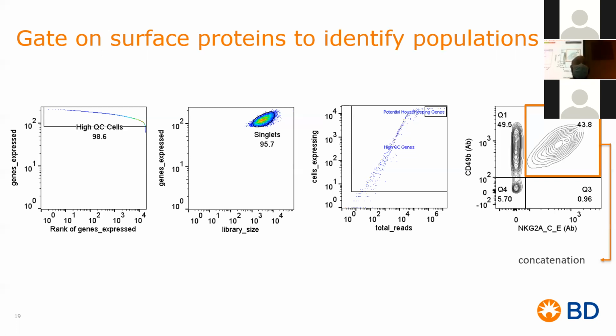Because most likely all my untreated had low expression of cells, and I removed those. I can't compare something non-existent to something that is existent in the analyses. So the QC step matters on what kind of question you're asking. So this is a targeted panel comparing untreated versus two different types of treatments, so I don't include dispersion. If I was doing something else, where I just wanted to see the difference of genes within one sample treatment, then I include dispersion QC.